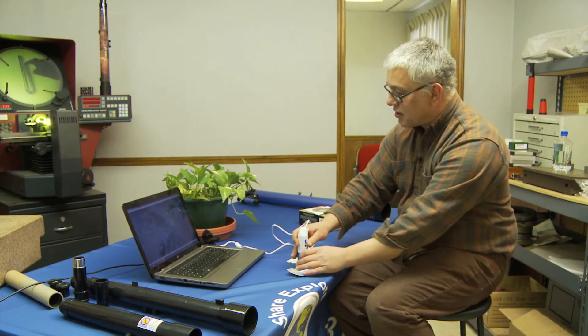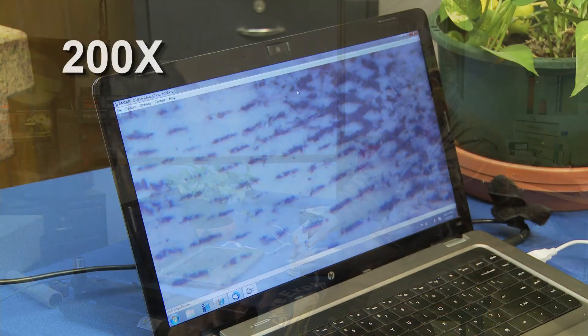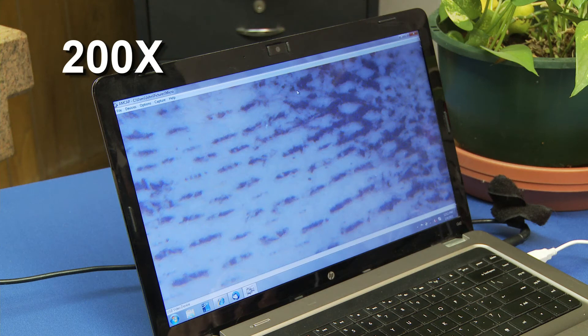What I'm going to do now is I'm going to bump this baby up and we're going to go to 200 times. Total different feel. Now you're looking at the dollar bill at 200 times.